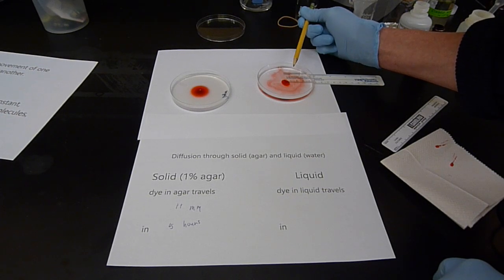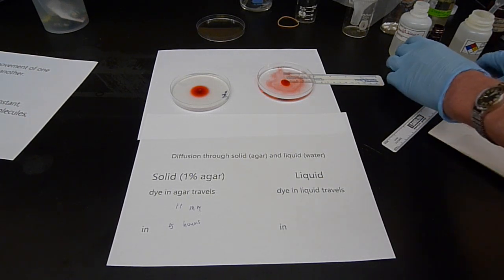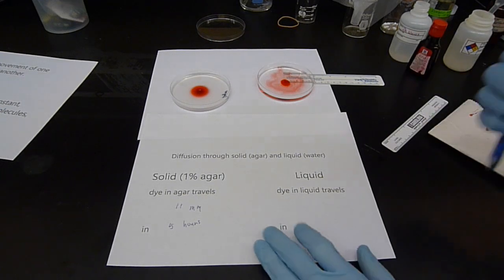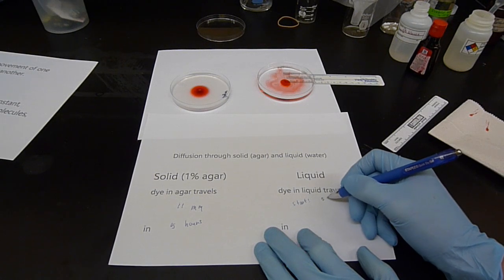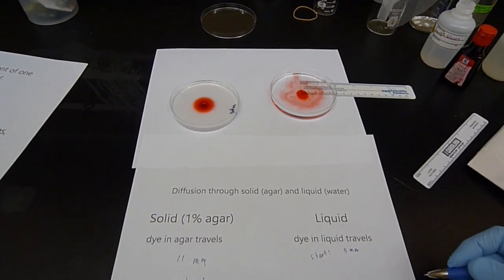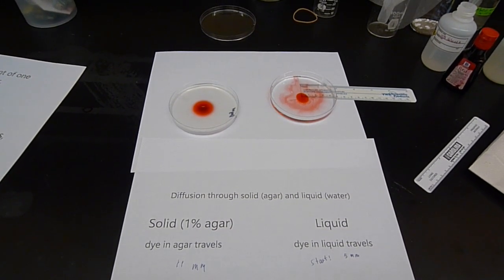That's just some strange solubility effect. But we're going to take it at 5 millimeters to begin with. Let it go for a couple of minutes, and then measure the position again. So for the start here, it's at 5 millimeters, and we'll see how far it diffuses in maybe 3 minutes or so. So we'll be back in about 3 minutes.